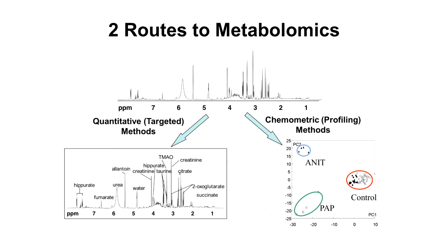In the quantitative, targeted deconvolution methods, you start with your spectra and immediately identify everything and quantify everything. And now you have lists of metabolites and their concentrations. And from that, and with those lists, you can actually do all kinds of things, which also include statistics, not unlike what's shown here.